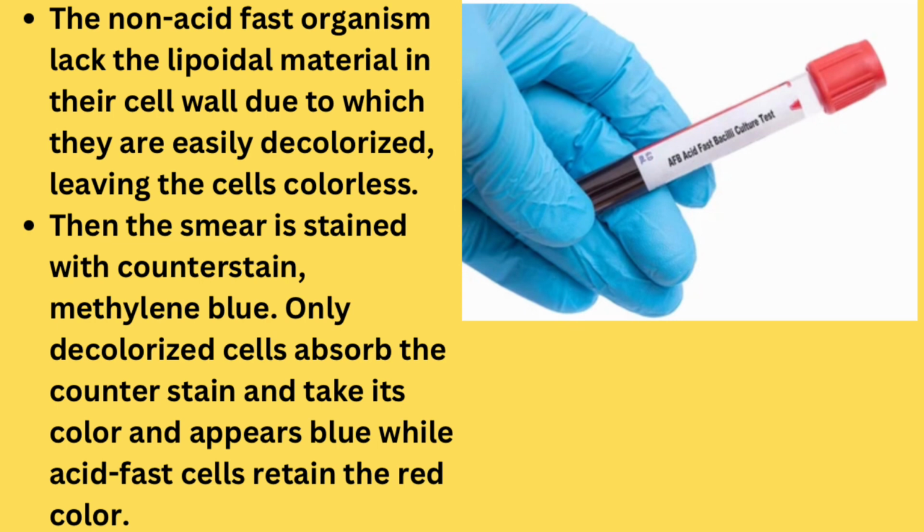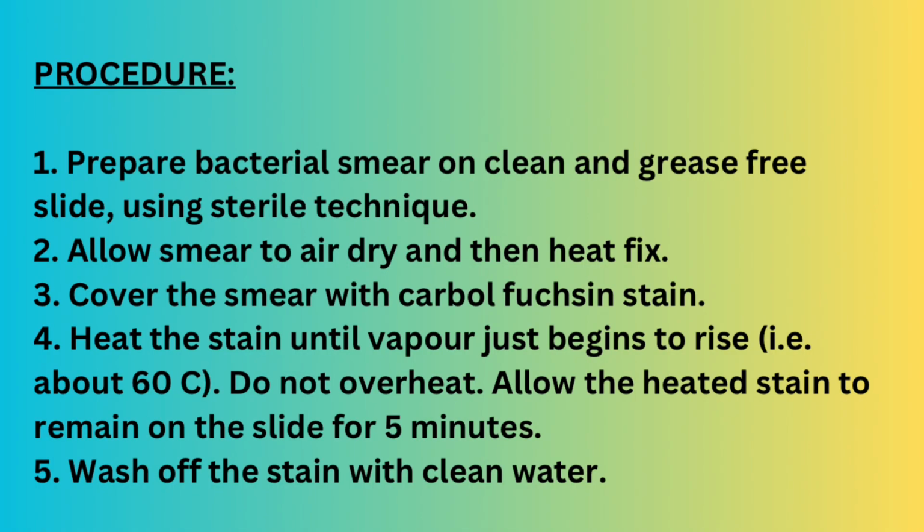Then the smear is stained with counter stain methylene blue. Only decolorized cells absorb the counter stain and appear blue, while acid-fast cells retain the red color.